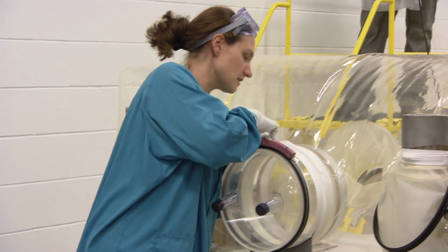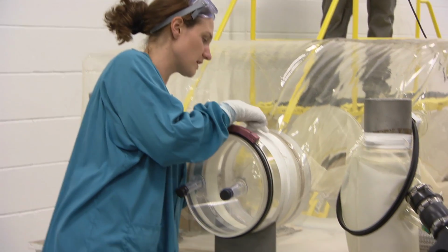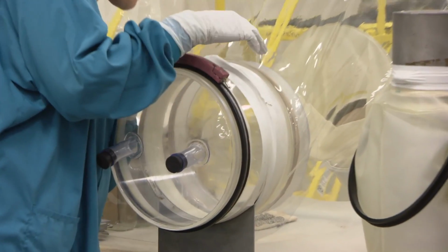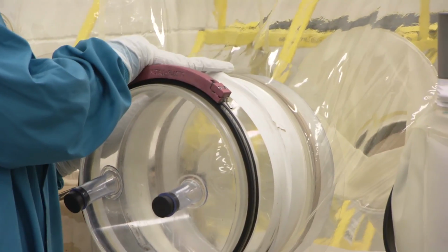So we also want to look at our bands. We use 2 rubber bands, and the bands are placed one on top of another with no twists. Since everything there looks good, we can then go and look at our cylinder.